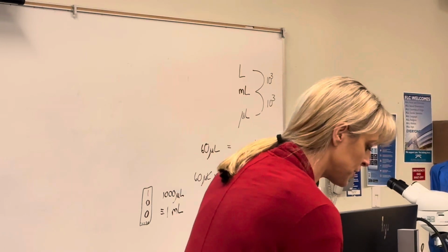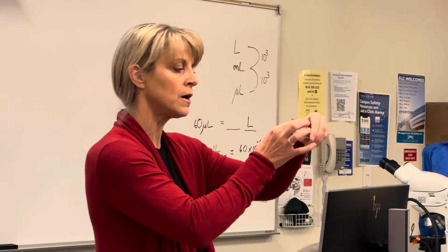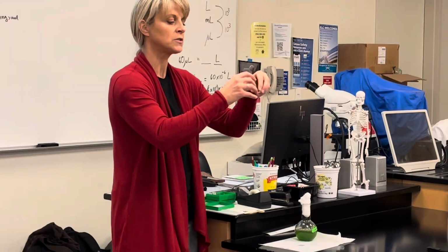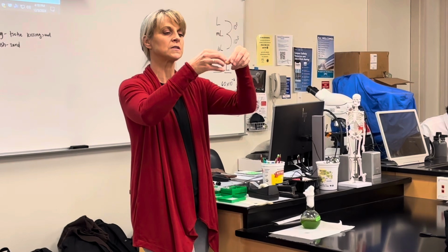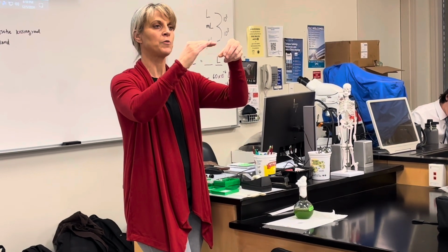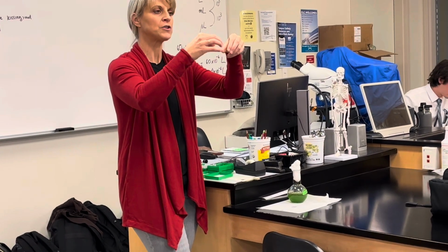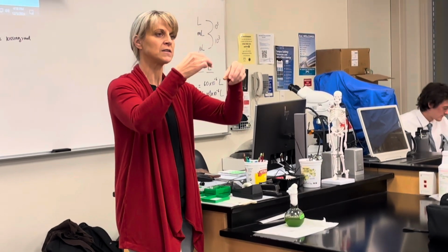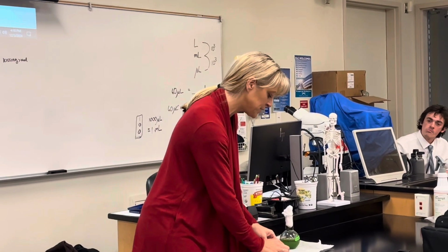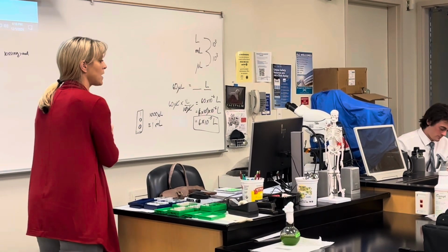So I'll make a little wet mount. It's called a wet mount. You put one little drop onto here. The technique, I know we haven't done very many wet mounts, is holding the cover slip at 45 degrees and then dropping it, and that helps prevent getting air bubbles in there. Even though sometimes air bubbles are beneficial when you have something that moves around because they get stuck and can't move. Or sometimes you can use something like glycerin so they move real slowly. But yeah, I'll show you what they look like up on the microscope.